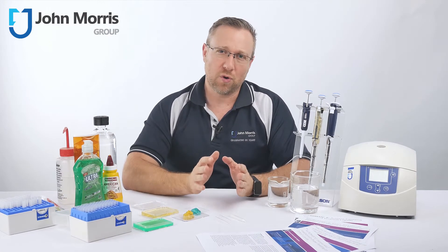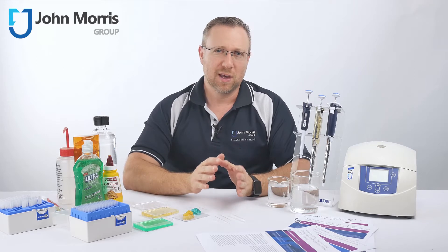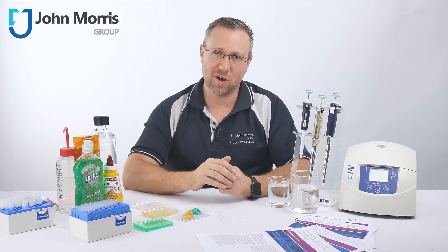If your laboratory does a lot of pipetting, you already know some liquids just don't want to behave when you try to pipet them. If this has ever happened to you, stay tuned for the next few minutes as we introduce a neat little product which will put that smile right back on your dial.